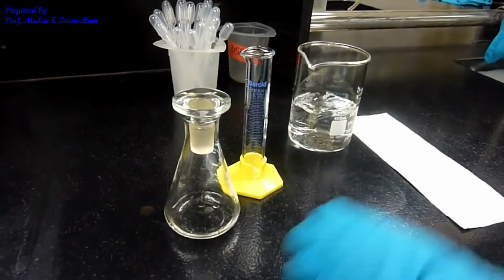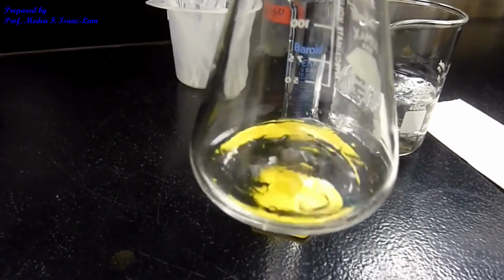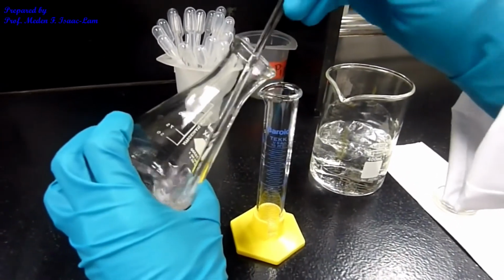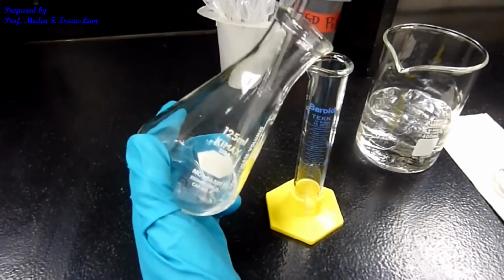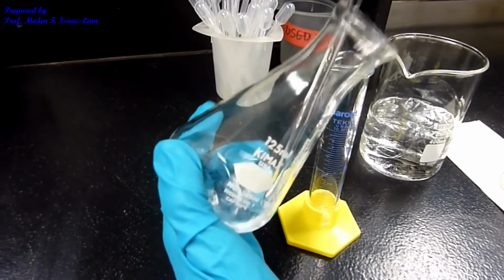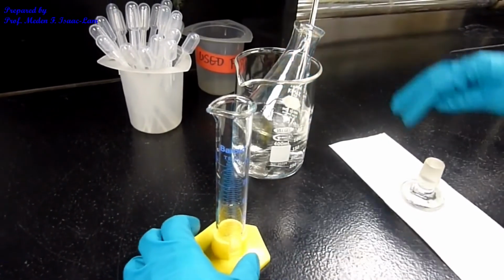So you see that it's forming like a blob. At the bottom, it's oily. So to precipitate it out, I can chill it, and also I can scratch the inside for the precipitate to come out. So scratching it facilitates precipitation. If it's not working, I'm gonna chill it here for about 5 minutes. If it still doesn't come out, we will microwave it for another 1 minute.